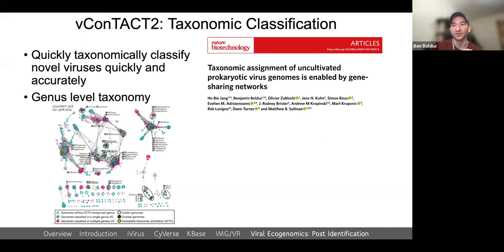That's actually pretty good when you're considering you could be looking at totally novel, totally naked viruses, with zero known proteins predicted. So you can have literally 10 genes, all hypothetical, and we can have pretty good confidence that we can put it into the correct genus for you.